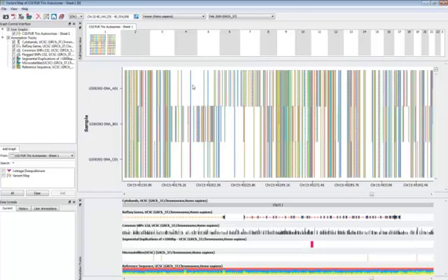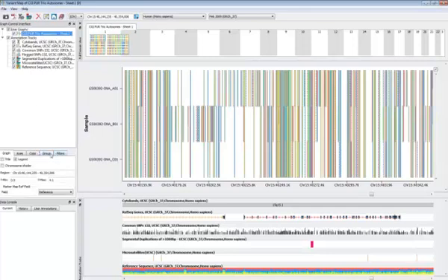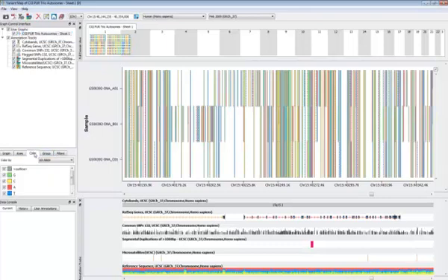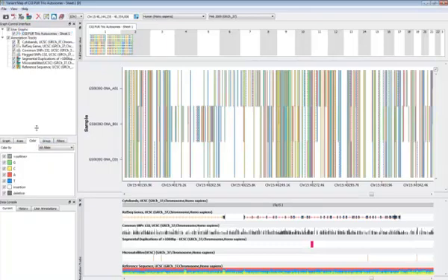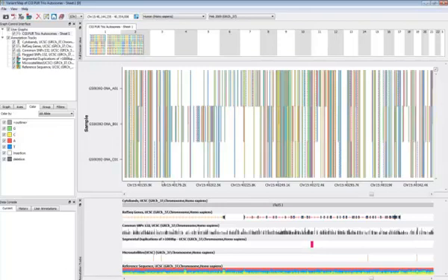We can see that any area that is white indicates a position where the sequence matches the human reference genome. Anything that is colored indicates a departure from the reference. So if I go over here, I can see a key that tells me that any place I see green means that there is a G base observed as opposed to the reference. I can zoom in a little bit closer and find out more about it.